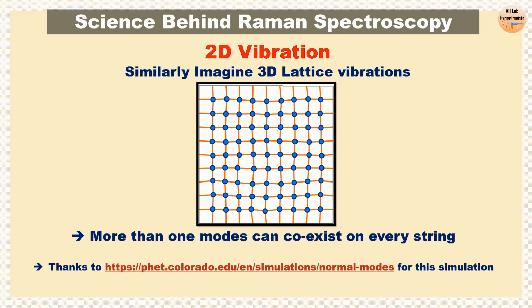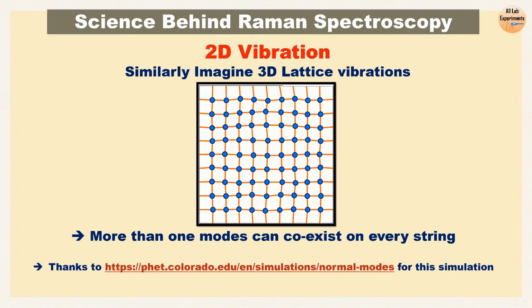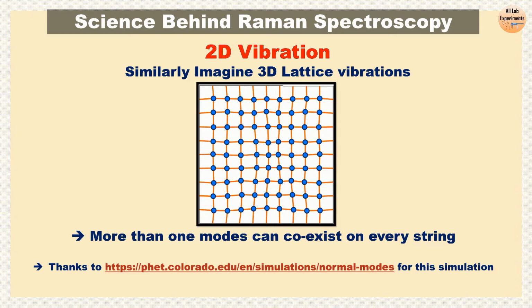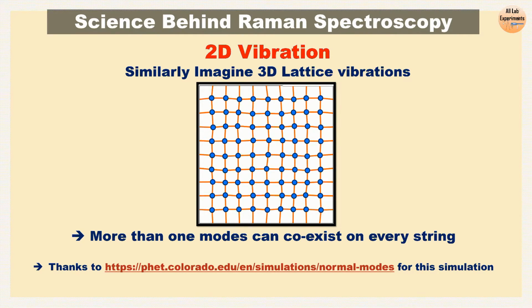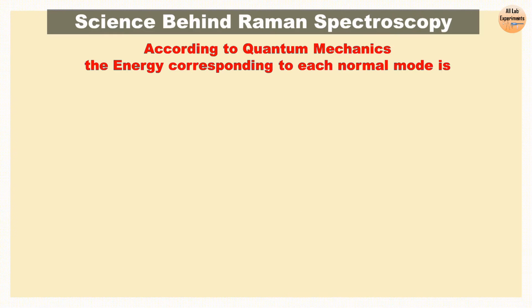Many physicists use group theory to consider all the possibilities of vibration in a structure of atoms. Their Raman activity or inactivity is another thing, but all the possible vibrations could be suggested by group theory, and physicists do that.